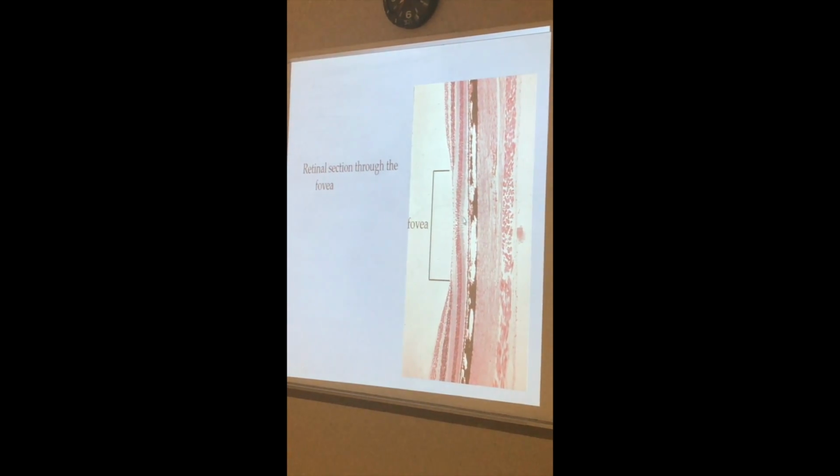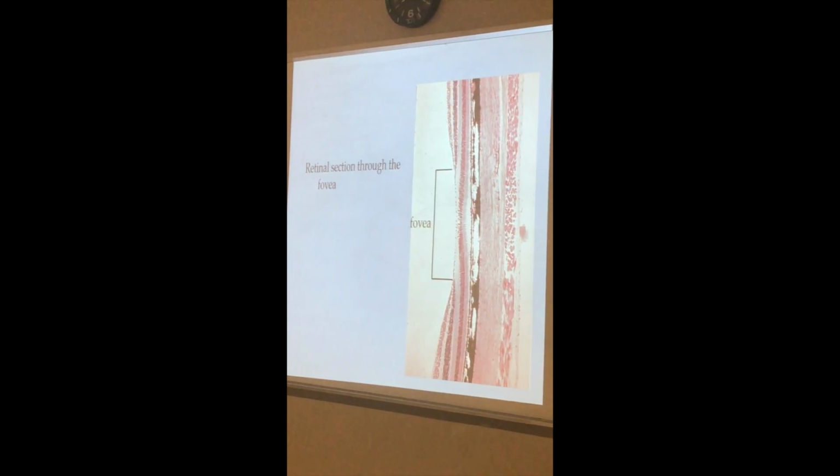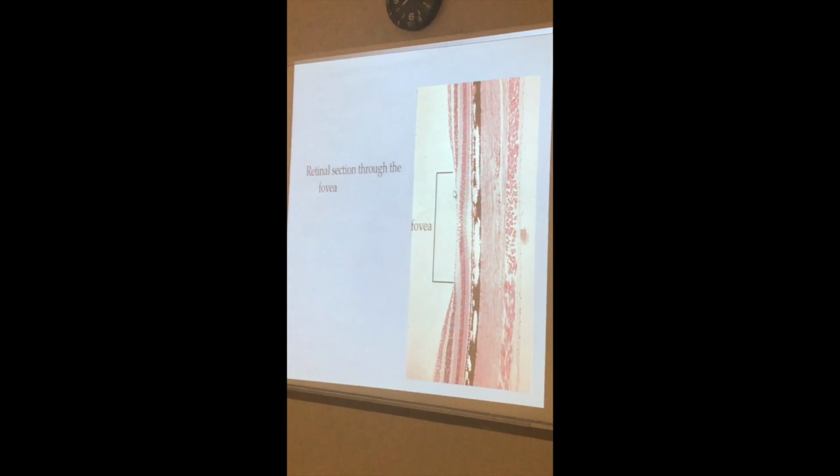It goes right from the cones right to the ganglion cells. I thought it was just thin. It looked like there's still a line. Yeah, there is a line there, but that's going to be the ganglion.